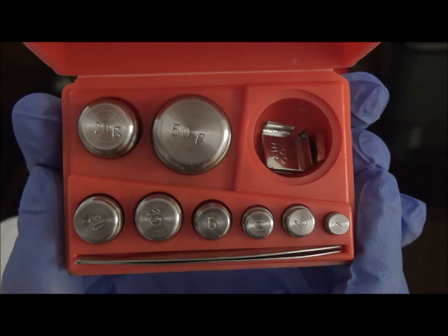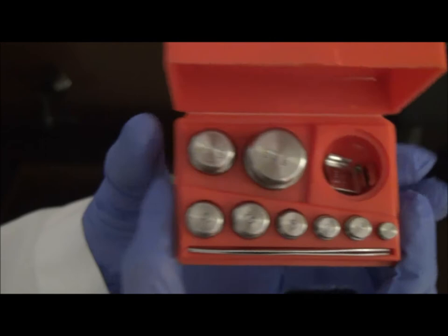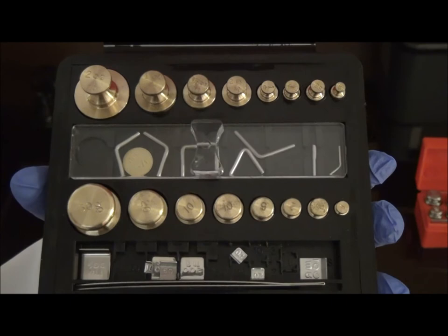Throughout pharmacy school, you will be using this specific metric weight set. However, for completion purposes, we will be using this weight set, which contains both apothecary and metric weight systems.